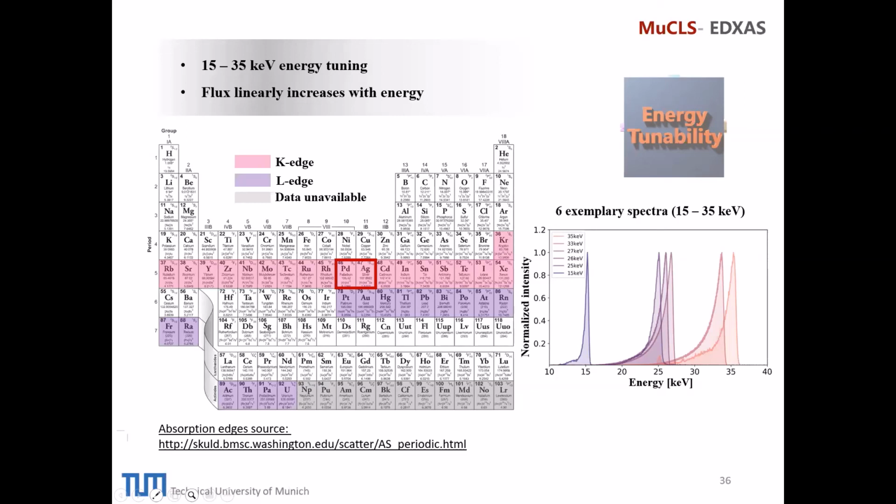Yeah, I would agree with that. It's somewhere in between. I haven't ever operated the accelerator of a big synchrotron, so I don't know how involved that is. It's an accelerator, so it's not like a push button. You have to tune up the accelerator, but you don't have to be an accelerator physicist to run it. So from the complexity, I would say it's more like setting up an X-ray beamline at a synchrotron, more like operating a beamline.